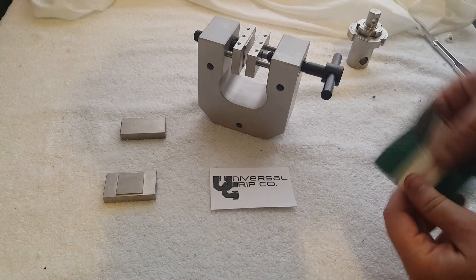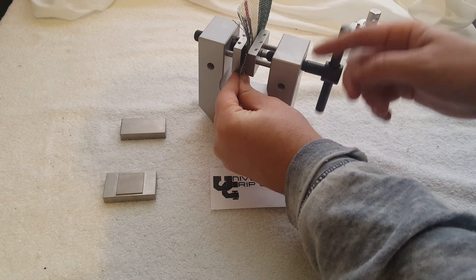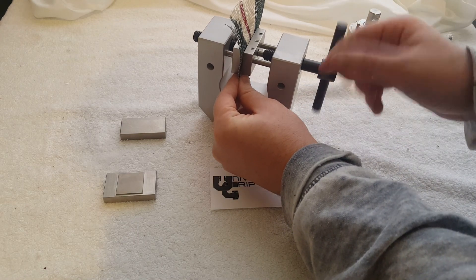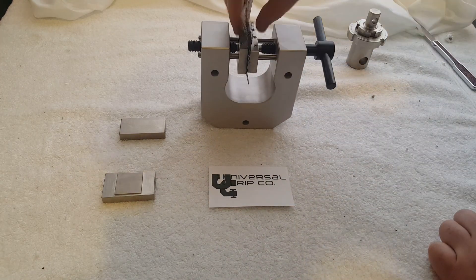So if we want to test some textile according to ASTM D751, we load it in, go ahead and tighten it, and there you have it.